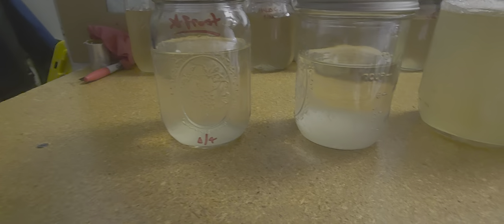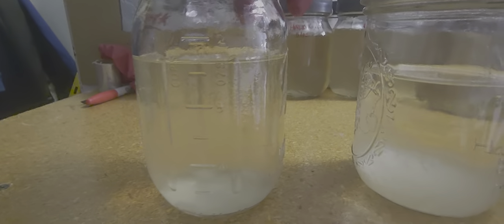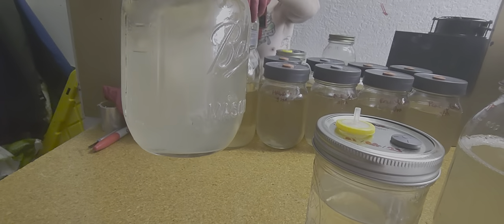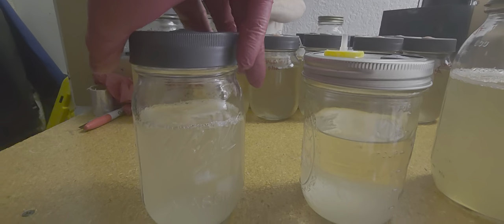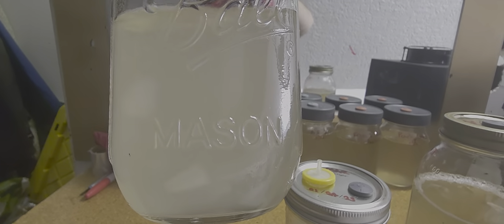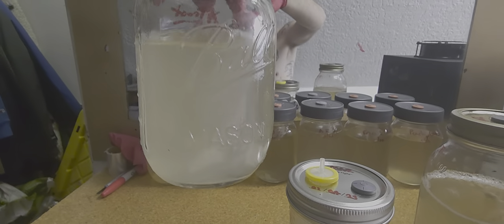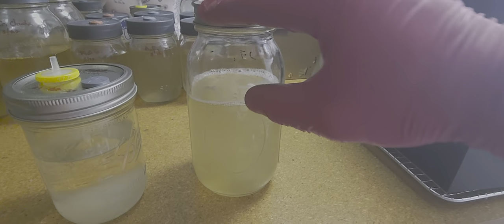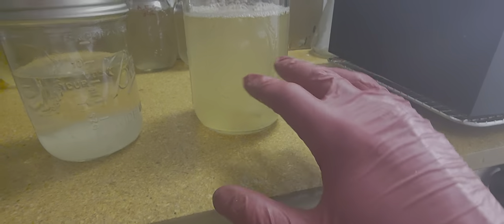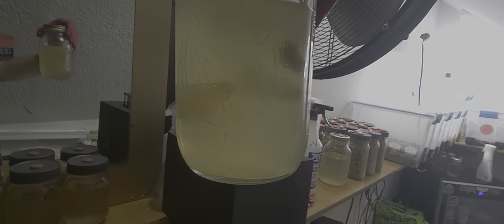So that is a good indication she is contaminated. This one — see how it looks clear here and it's all kind of settled at the bottom. Let's go ahead and shake this one up. Yeah, see that — now she went from clear to looking like straight garbage. I'd say she's bad. That's just my expert opinion. Yep, that's a good indicator that she is contaminated, and this one did not produce much mycelium. The other one had a huge culture at the bottom and it looked great, but when you shake it up she turned out looking like that — no good.